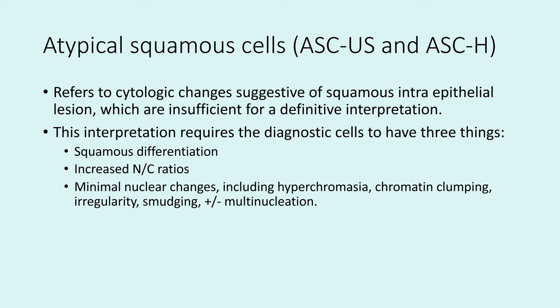Atypical squamous cells refers to cytologic changes which are insufficient for definitive interpretation. It requires diagnostic cells to have three things: squamous differentiation, increased nuclear-to-cytoplasmic (NC) ratios, and minimal nuclear changes including hyperchromasia, chromatin clumping, irregularity, smudging, and sometimes multinucleation.